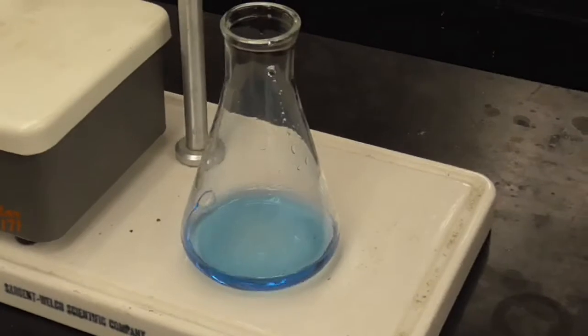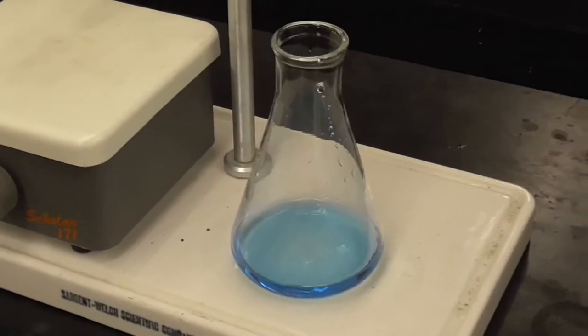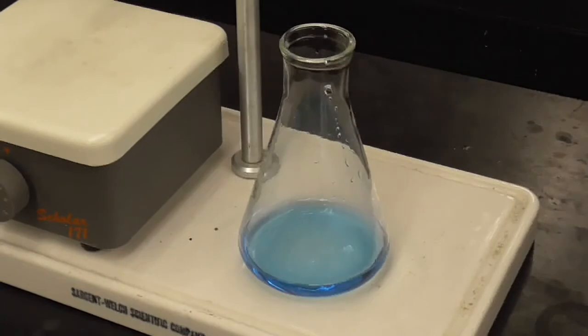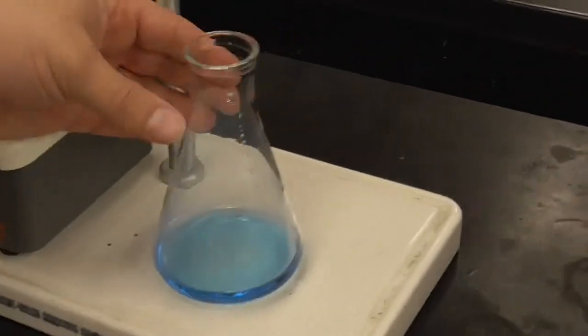It says titrate the solution until the endpoint is reached. It says when bromothymol blue is used, it should initially turn blue, which it is. And then as the endpoint is approached, it will turn green, right? And then it'll go yellow. So that's the idea here. So we're going to add our stir bar.